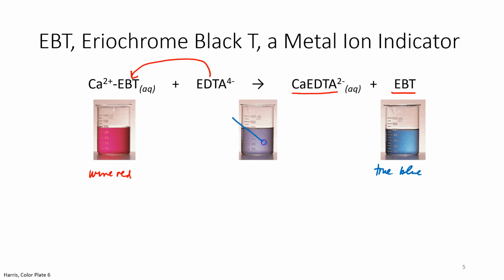But this is not the endpoint. You want to go all the way to that true blue. So again, wine red to true blue is our color change.